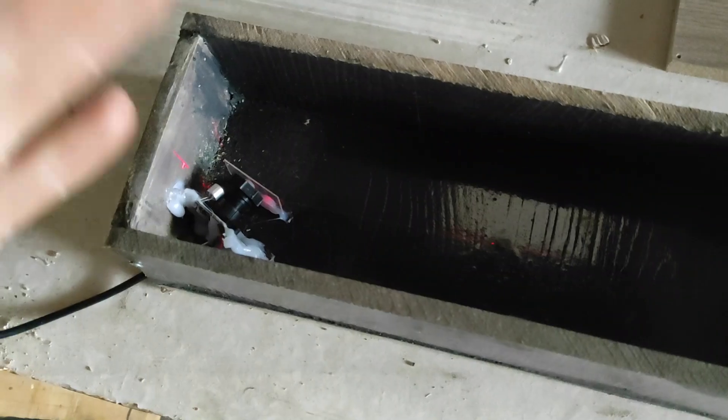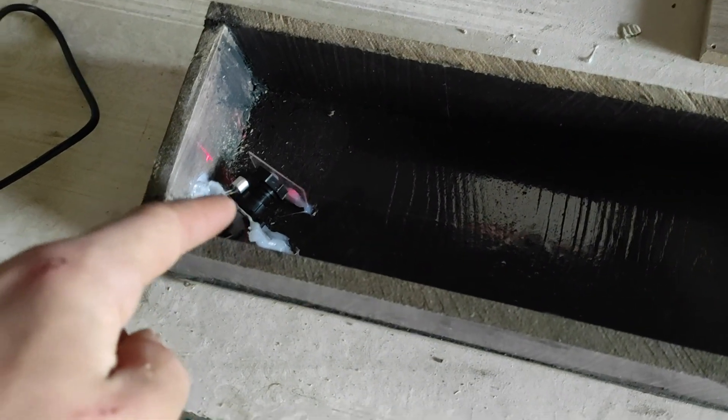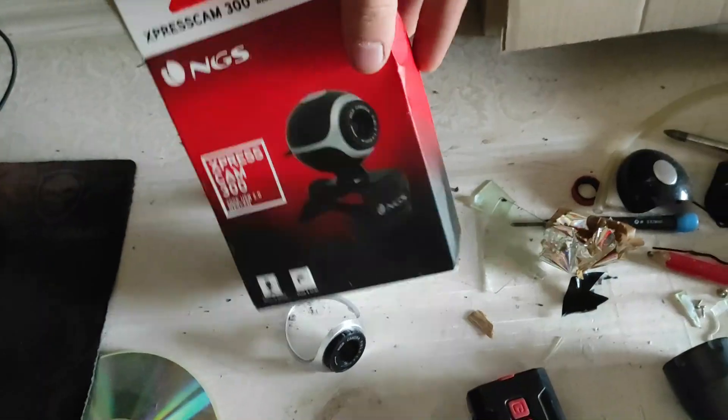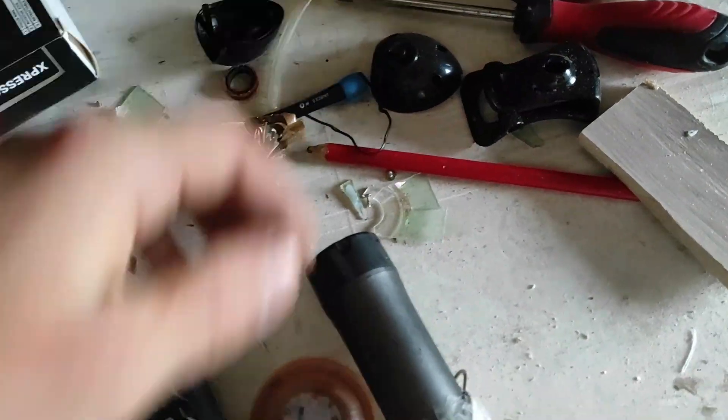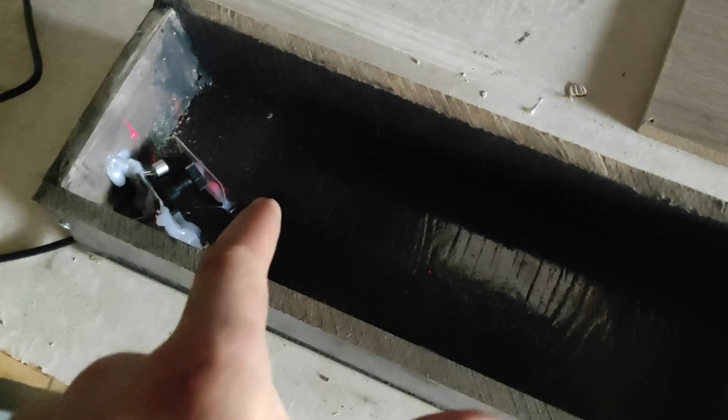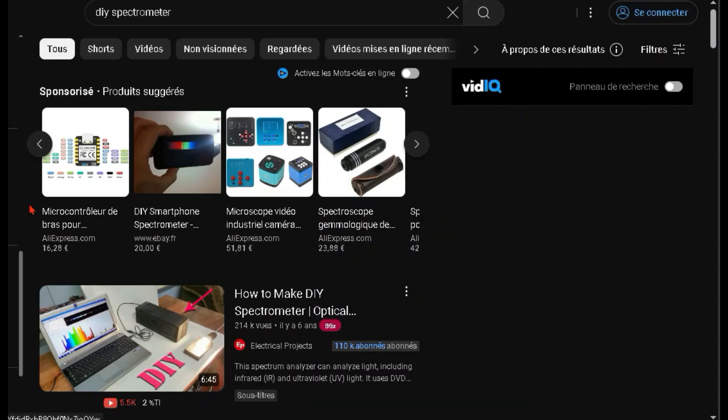Then to receive the rainbow, we need a light detector. So I bought a cheap laptop camera on Amazon and I removed the plastic casing. And finally, you need the box to put everything inside. I'm not going to detail the construction further though, because there are lots of good tutorials on YouTube.